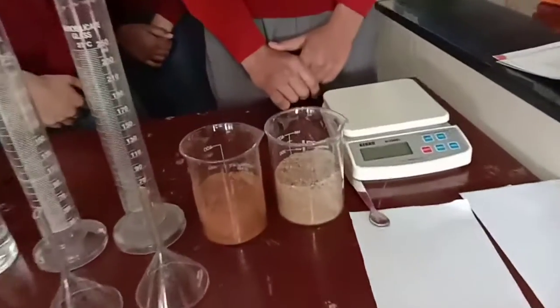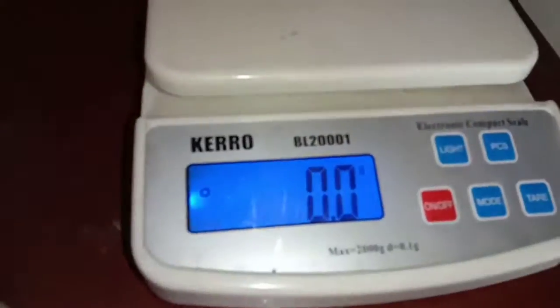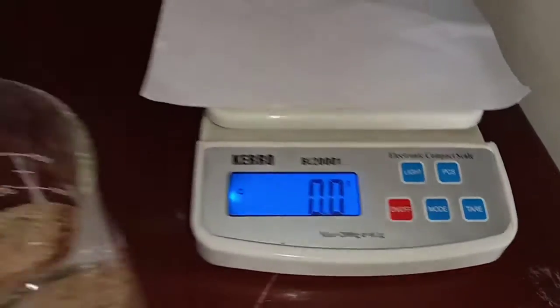The principle of this experiment is that the water holding capacity of the soil is the amount of water retained in the capillary space. Capillary space is the space between soil particles after the percolation of gravitational water into the deeper layer.